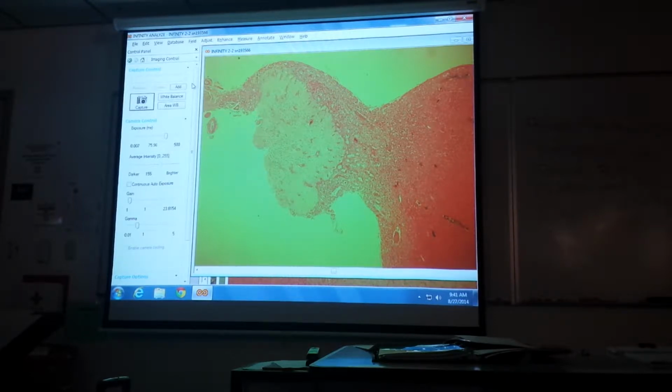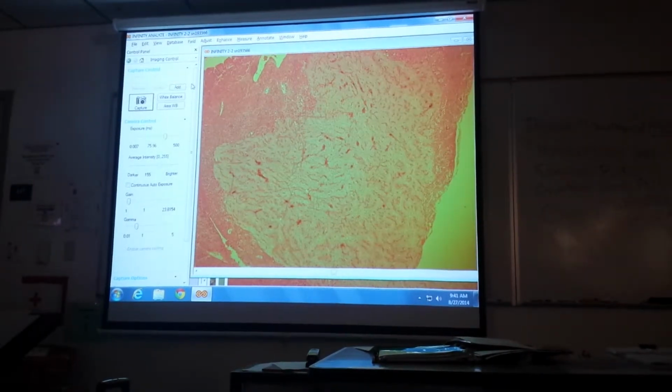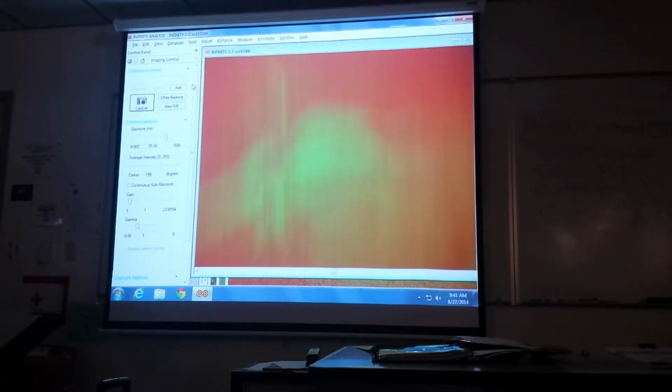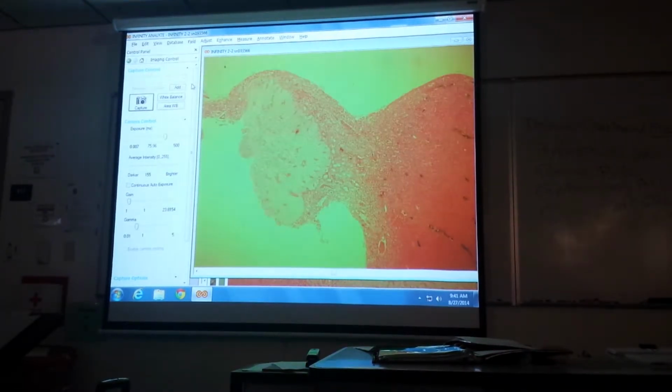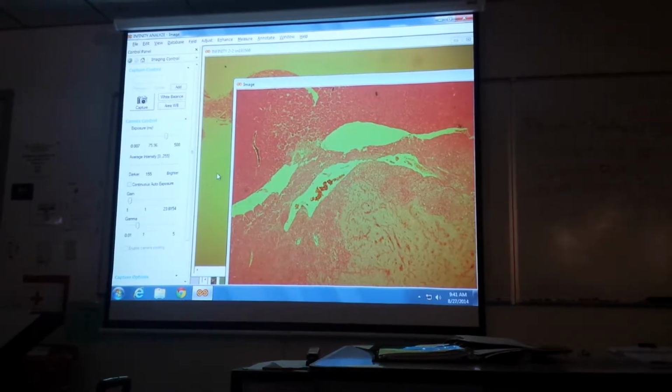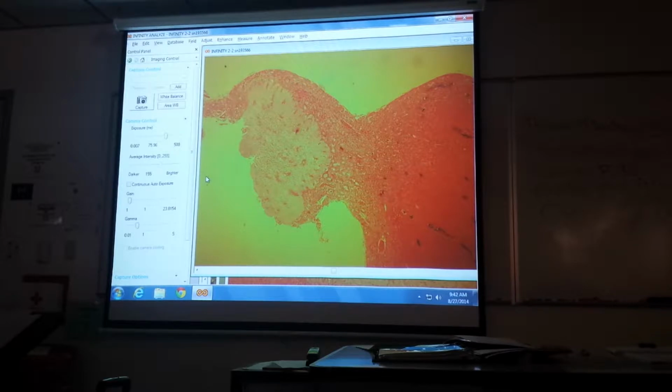Let me do it one more time. And here's the stalk, the posterior lobe down there. The infundibulum is hiding up here, this little piece. Okay, so let me take a picture of that. Okay, and that's the hypothalamus. Move on, that's all you have to do. Any questions on hypothalamus?